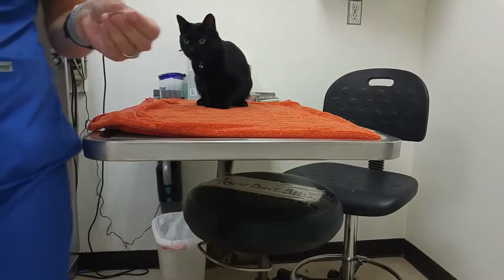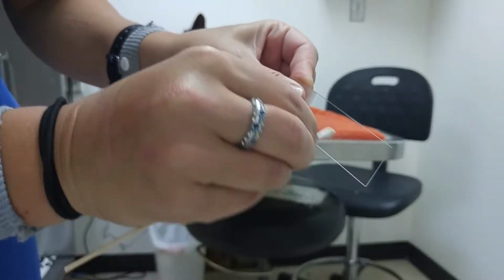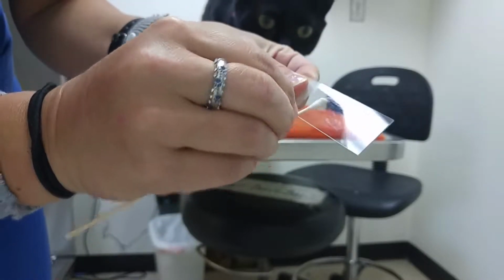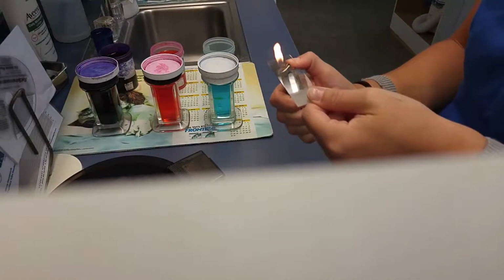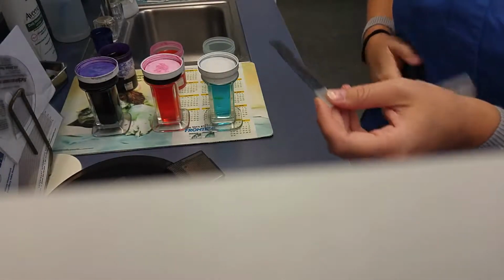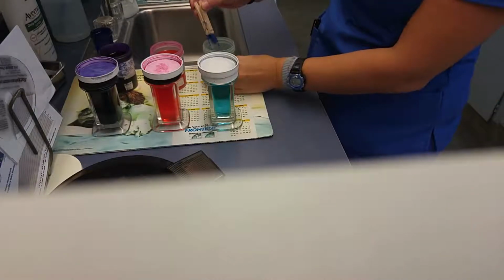We're going to go ahead and take it and just roll it onto the slide, and then we're gonna take it and heat fix it real quick. Make sure it gets rolled on there really good. I'm gonna go ahead and heat fix it with the lighter, just kind of a few quick rubs underneath. We're gonna take a Kim wipe and just wipe off the blackened portion on the bottom, and take it and we're gonna dip it in the dip quick stain.